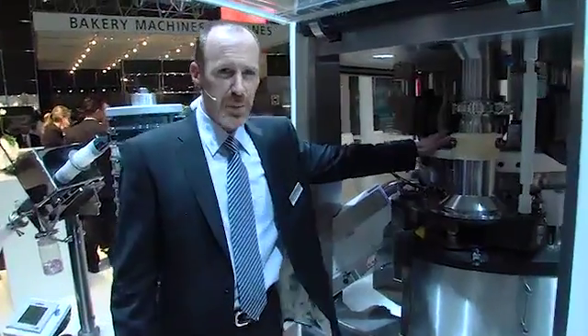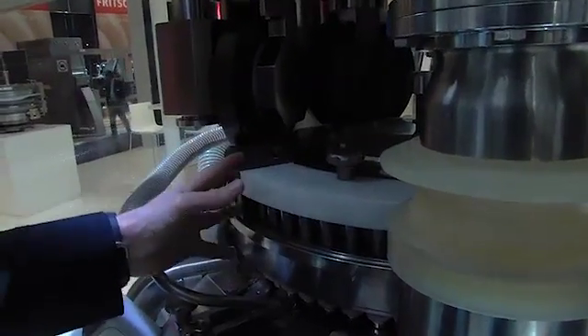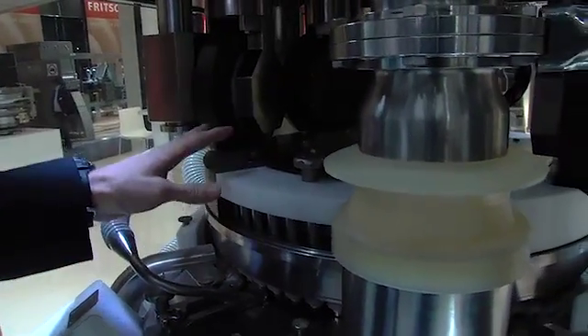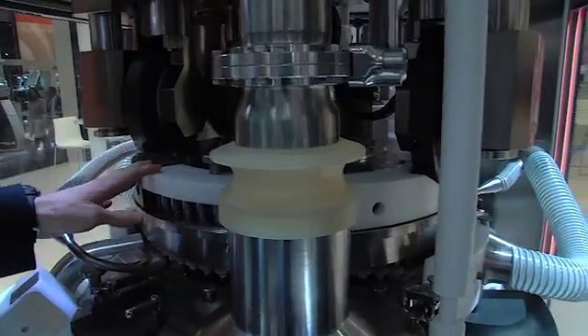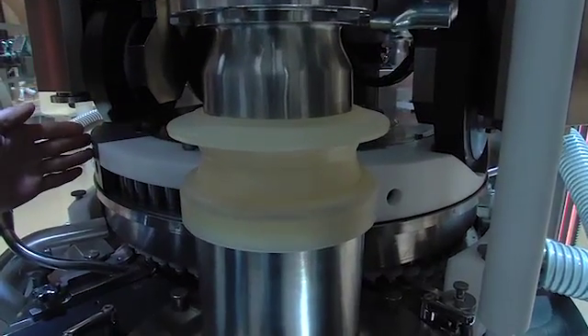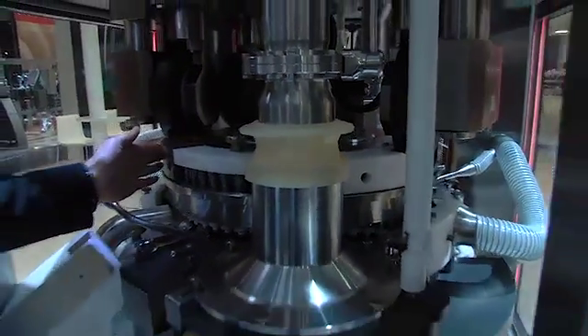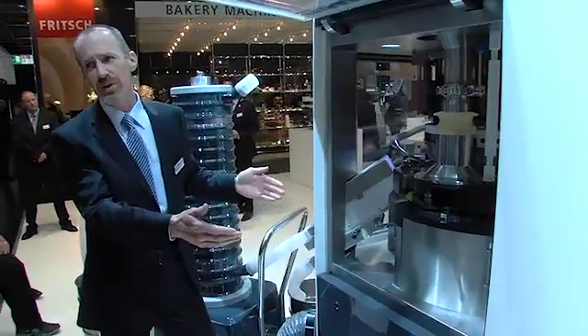With any tablet press, especially modern tablet presses, the heart of the machine is the turret itself. This is another huge improvement with the FE55, and in fact it is where we see the greatest improvement in overall operating efficiency. The footprint requirements for the machine are only 1.6 meters squared.